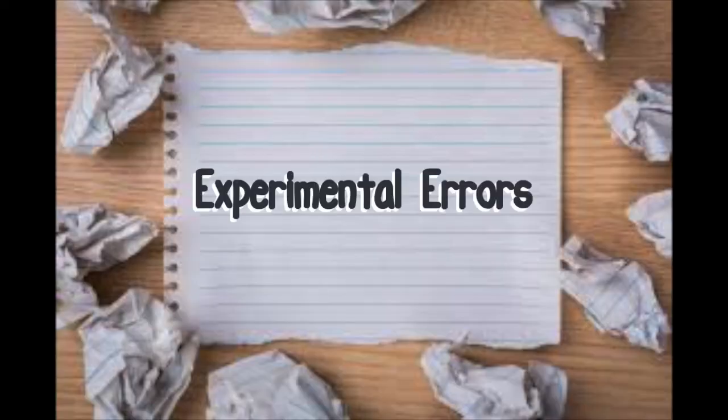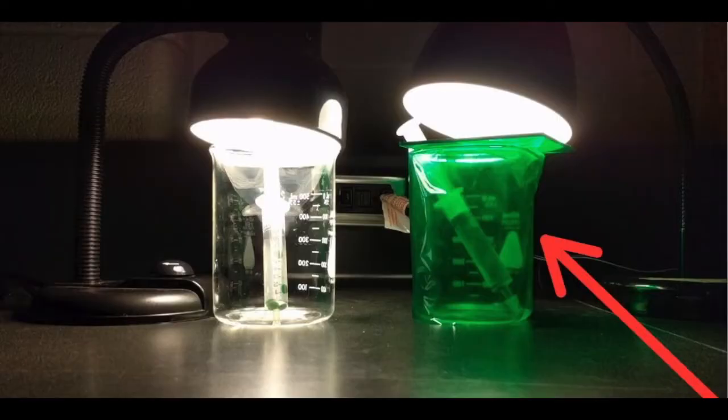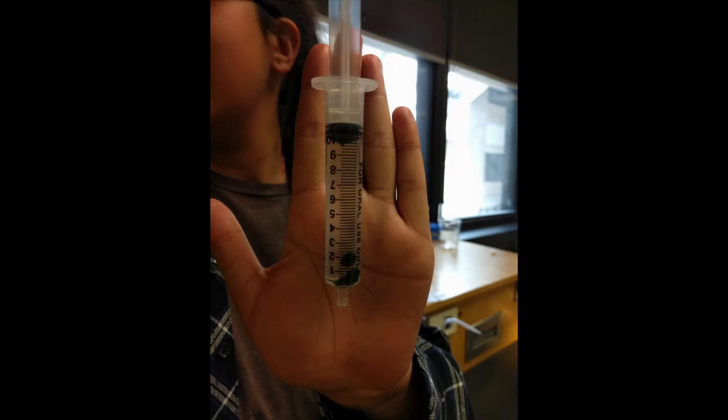Experimental errors. During this lab, 2 experimental errors arose. The first experimental error was having to prepare each syringe separately. We had to prepare the green light beaker first due to time constraints. As we were preparing the beaker, the syringe with the discs and the sodium bicarbonate solution were sitting in the light of the classroom for a good amount of time.